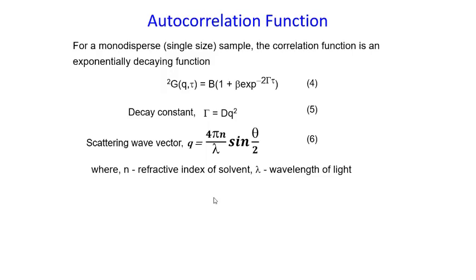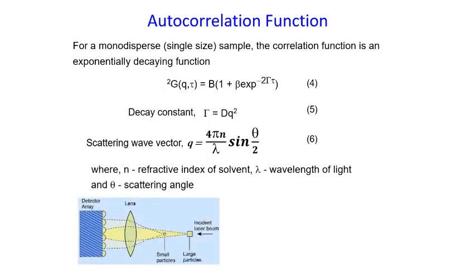And that is how the particle size information can be derived from this autocorrelation function, because it contains that size information and also the scattering angles. And it is also known that the scattering angles for the smaller particles is higher compared to the larger particles. The smaller particles scatter light at larger angles compared to larger particles, as you can see from this particular diagram over here, right?